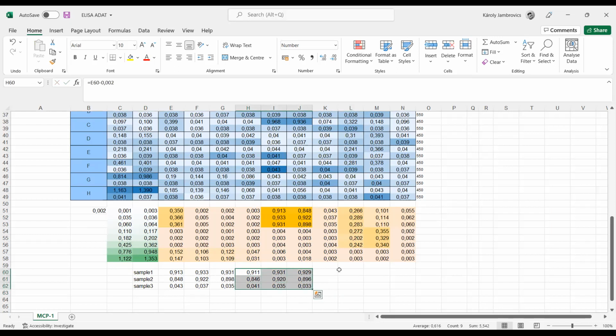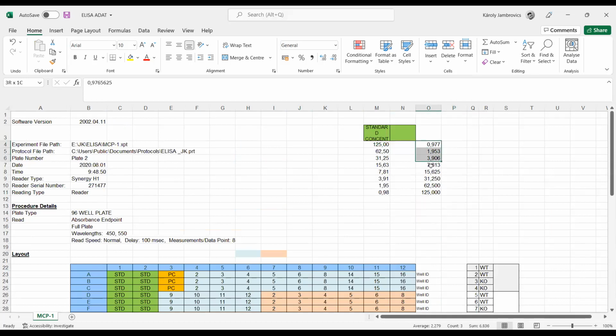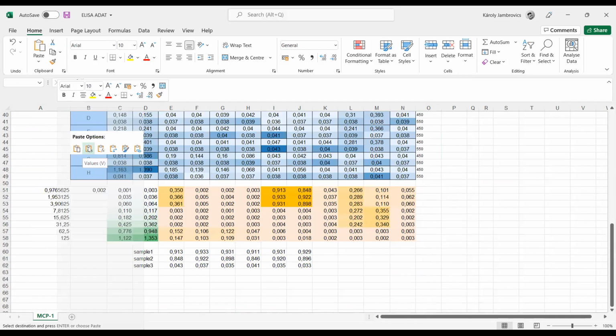But before we get into the GraphPad file, it is important to see that every ELISA is working with the standard, because the standard is well known, which means that somebody made a stock concentration of the sample, and then there should be the proper dilution every time. In my case, these are the ones which are the standard concentration. That's what you know from the manual as well.